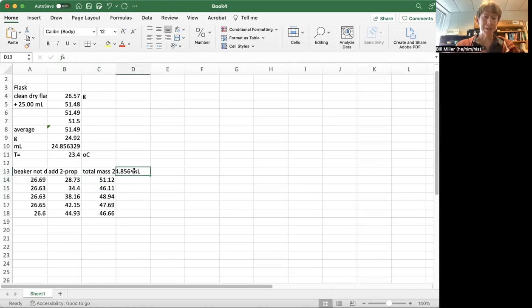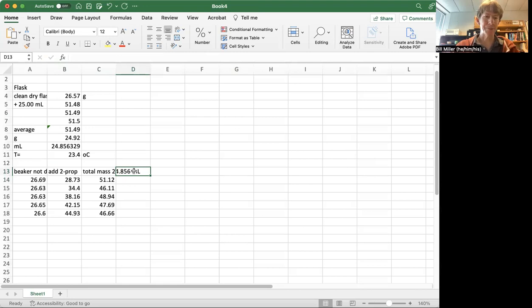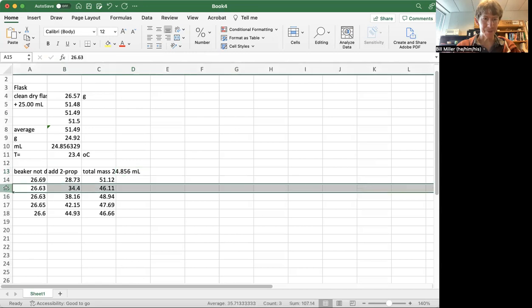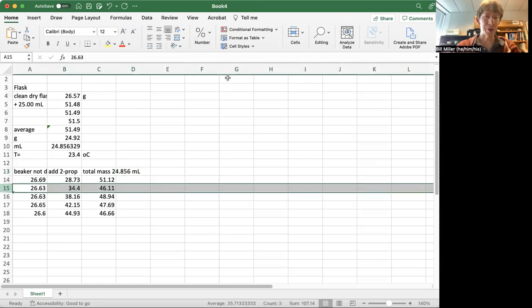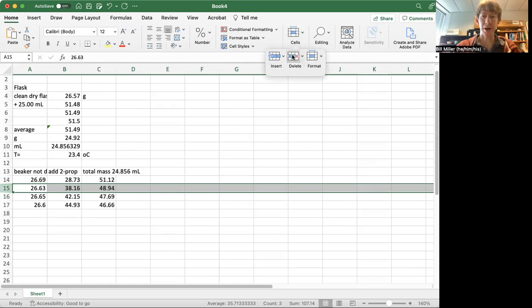And what I'm going to do is I'm now, and I only did a few points, I want to test it out. And one of my points is bad, actually, this one. So I'm just going to delete it now. I've run through this data before, and I saw that it was way off. So I only have four points.